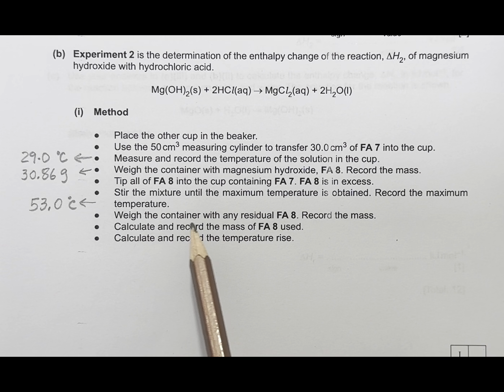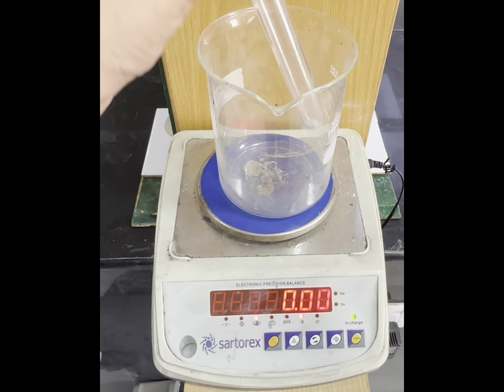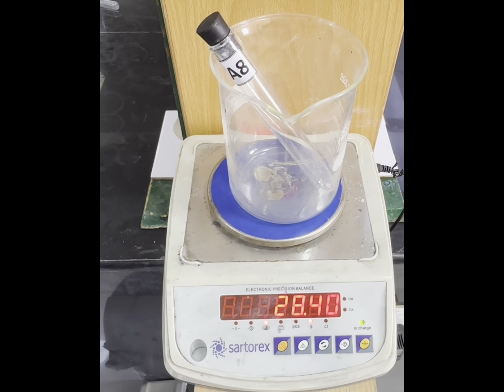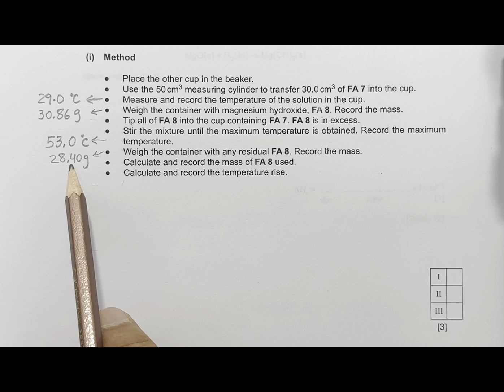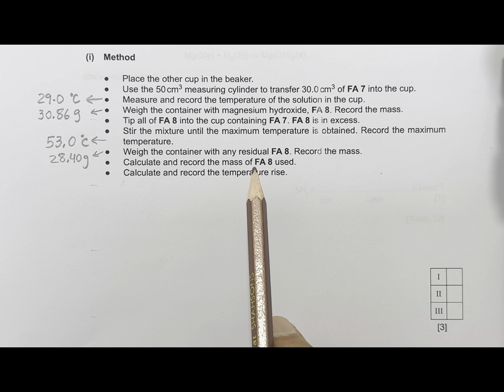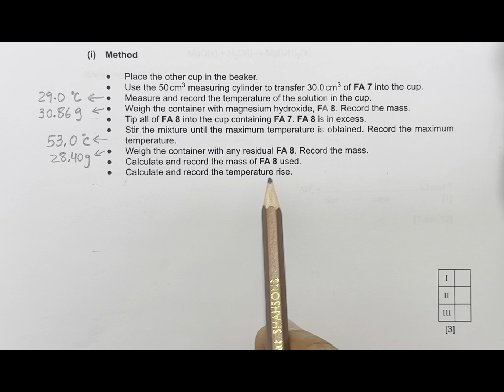Now weigh the container with any residual Fa8 and record the mass. Mass of container with any residual Fa8 is 28.40. Now calculate and record the mass of Fa8 used and the temperature rise.